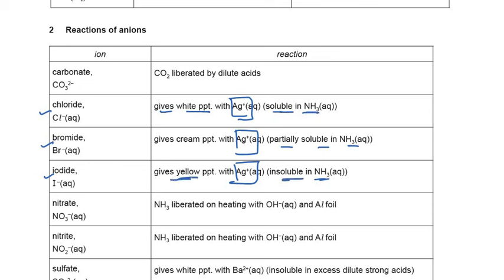So these are the 2 observations we got. We didn't get cream precipitates or any other white precipitates. So we knew that FA7 had iodide and FA8 had chloride. These are the 2 anions which we have already found out.